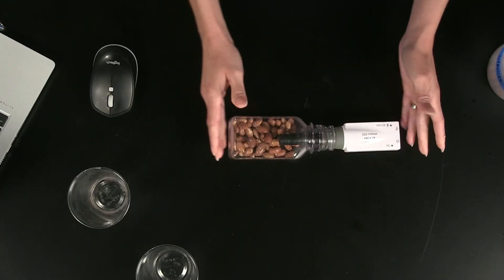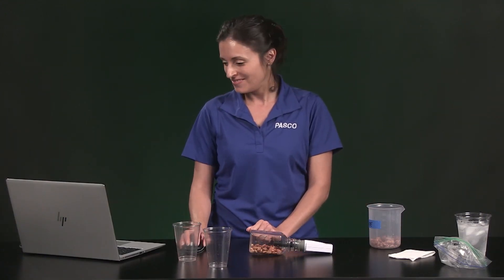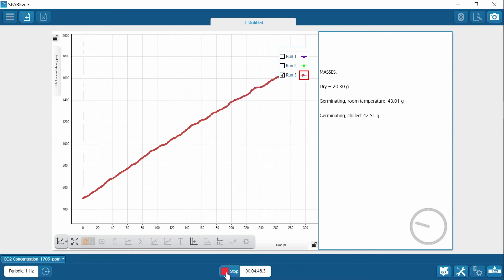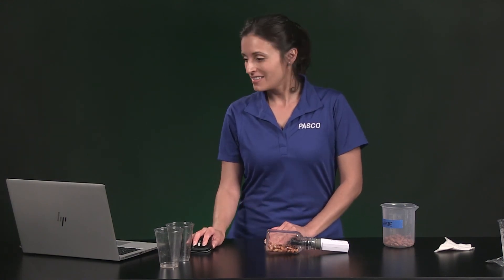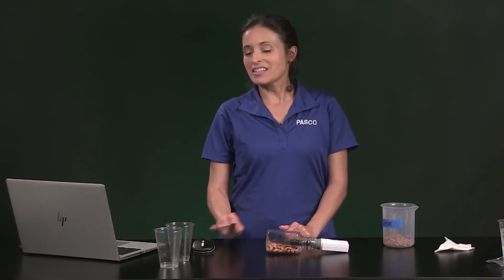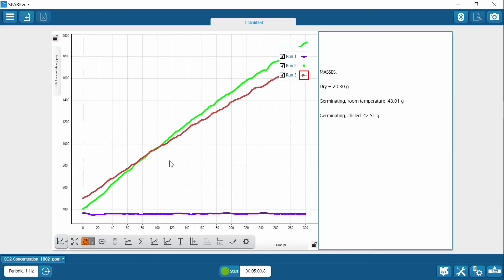I'm going to make sure that I don't get the sensor wet and I'm setting up horizontally. Now we will collect data for five minutes. Now I'm going to show all three runs. Record the initial and final carbon dioxide concentration in the table like the other two runs. For the analysis, you will need to calculate the rate of change in carbon dioxide concentration over time for all three runs. Knowing the rate of carbon dioxide change will help you make comparisons between the respiration rate of dormant seeds and germinating seeds at different temperatures.